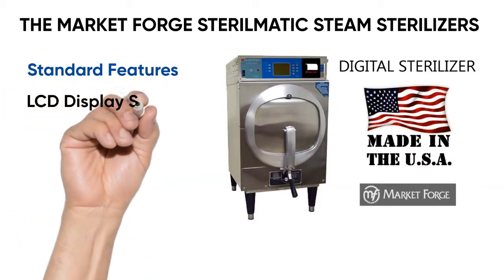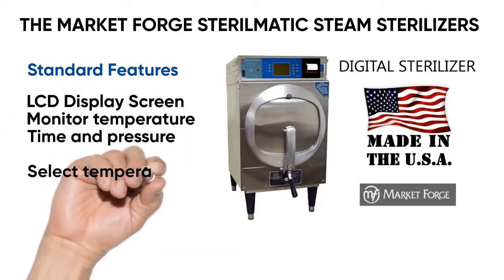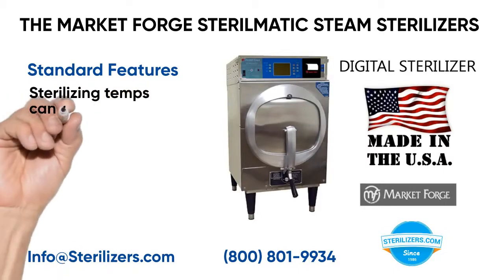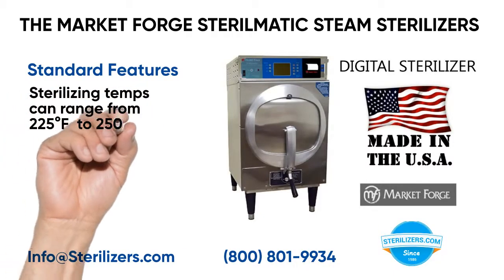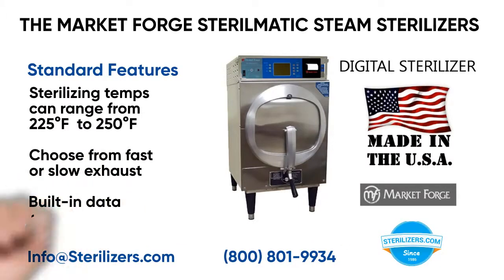Standard features include an LCD display screen to monitor temperature, time, and pressure. Select temperature in Fahrenheit or Celsius. Sterilizing temps can range from 225 degrees Fahrenheit to 250 degrees. Choose from fast or slow exhaust. Built-in data recorder and printer.